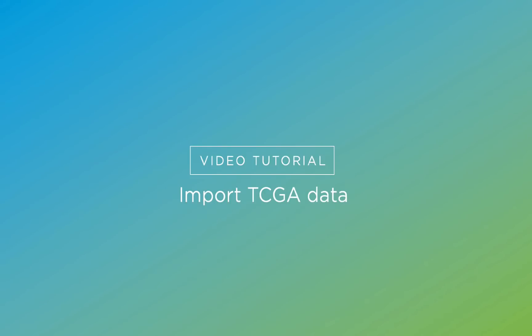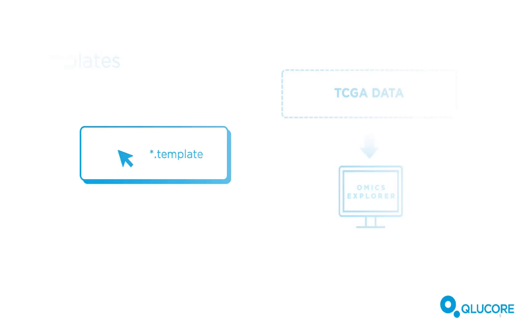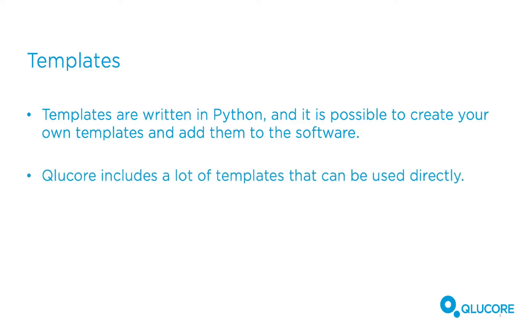The TCGA import is performed using a template. Templates are written in Python, and it's possible to create your own templates and add them to the software. CluCore also includes a lot of templates that can be used directly, and one of them is the TCGA import template. Let's start.